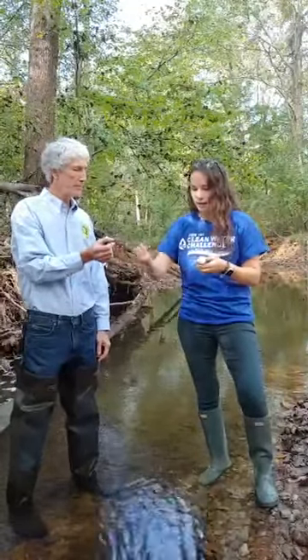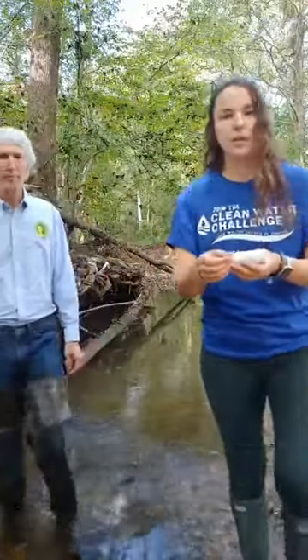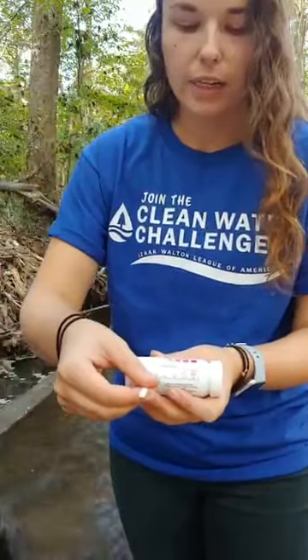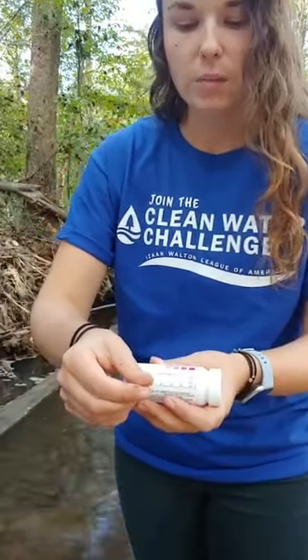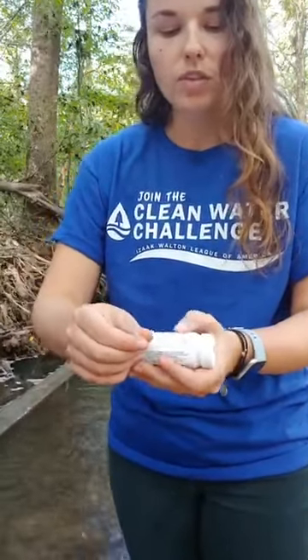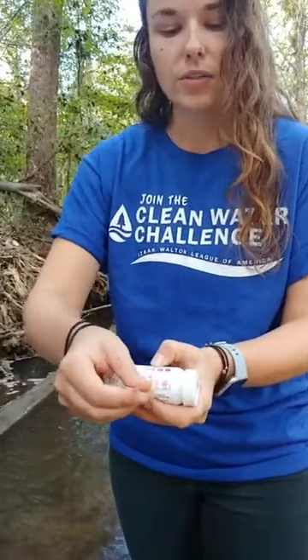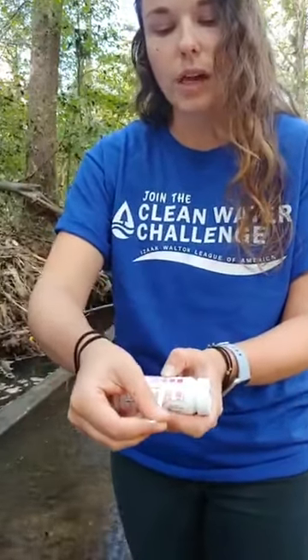And then when you're ready and your 30 seconds are up, you're going to compare the colors for your nitrate test strip. You hold it up and compare the colors, and we can track that over time. This looks like it's going to be in the one to two range for our nitrate levels. The drinking water standard from the EPA is about 10, so we're not quite at that level, which is good — that means our nitrate levels are pretty low.